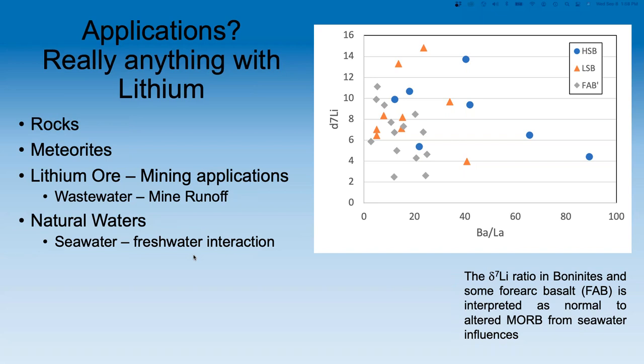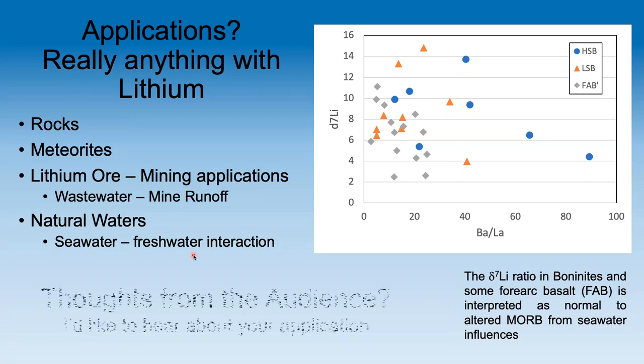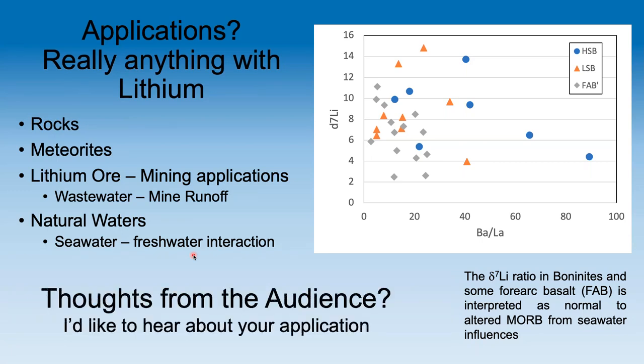Lithium, obviously, because of what we use it for, has its own applications. But I do believe, and one of the things that we're going to try pretty soon is other non-traditional stable isotope systems. And we really want to try and explore what our quad ICPs can do. So with that, I'd really like to hear your thoughts. I'd like to hear about your applications. I know I went a little over. I appreciate you sticking with me through this.